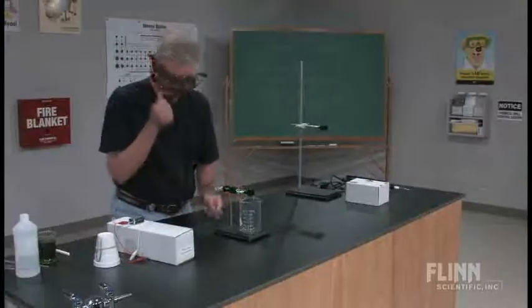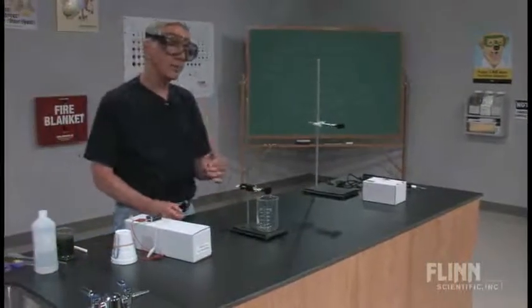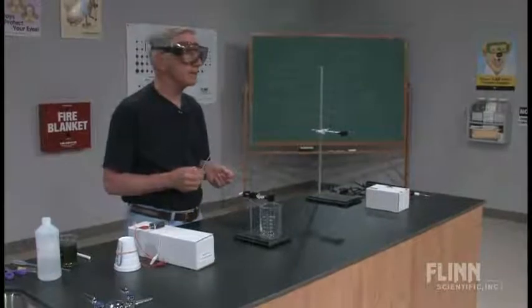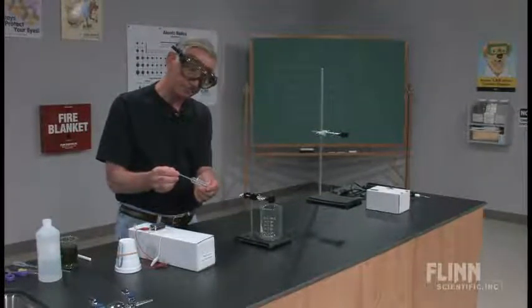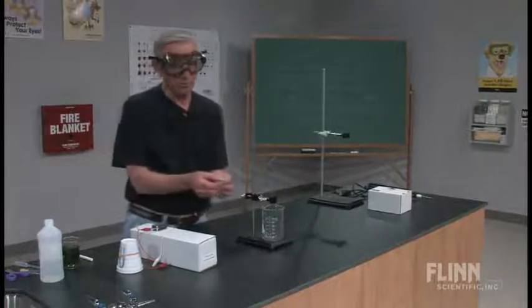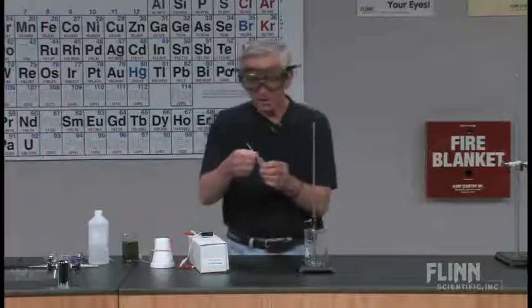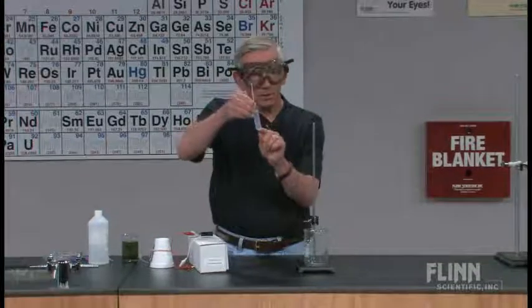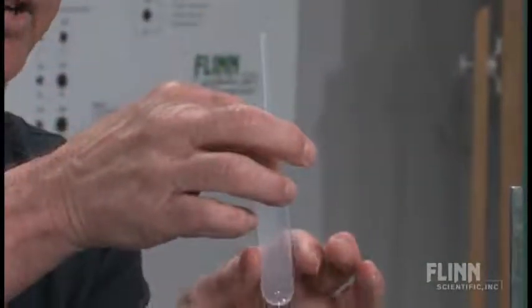What I want to do is carry out the electrolysis, but I want both gases to be collected in one place. So I'm going to take a super jumbo pipette, kind of like the thin stem that I used before at that part, but this is huge. I'm going to put the water in here and electrolyze it directly.